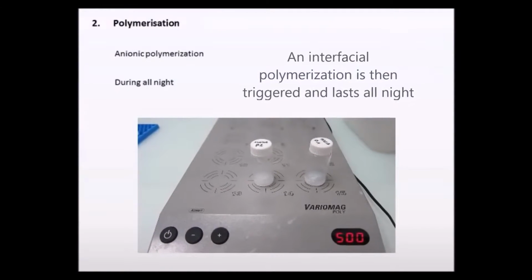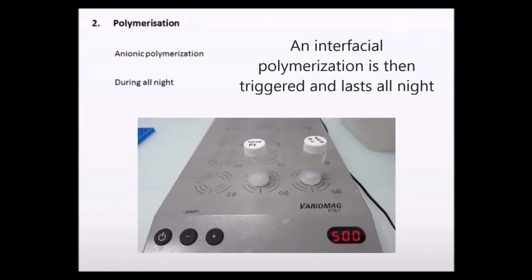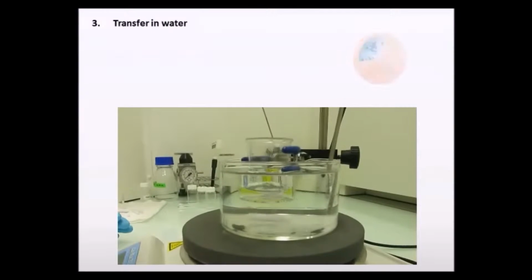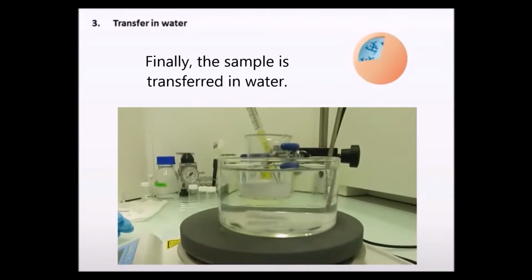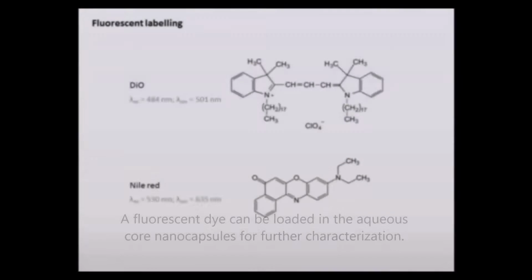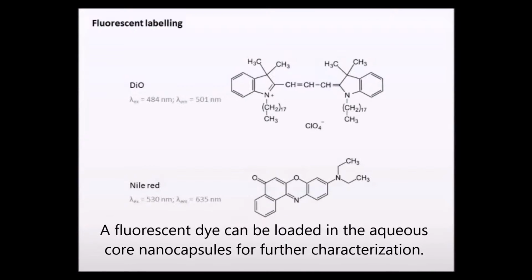An interfacial polymerization is then triggered and lasts all night. Finally, the sample is transferred in water. A fluorescent dye can be loaded in the aqueous core nanocapsules for further characterization.